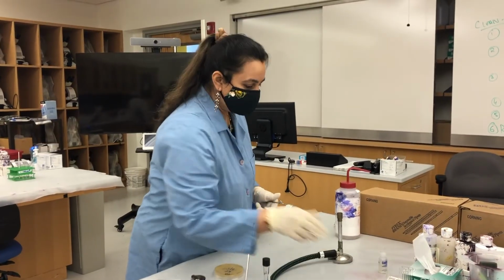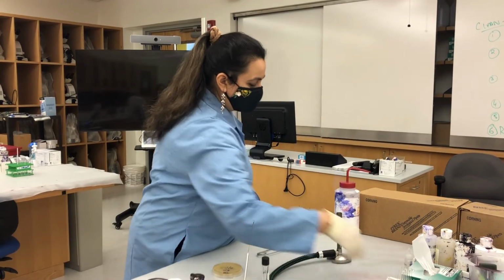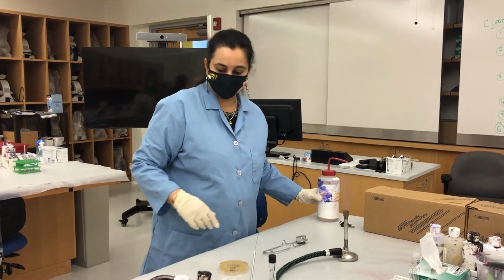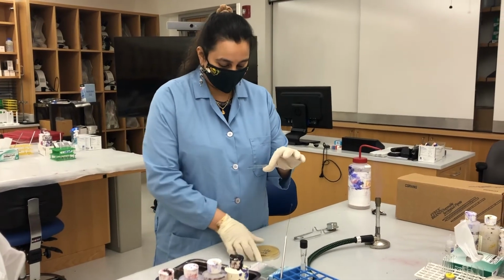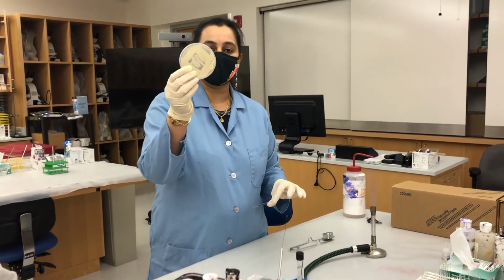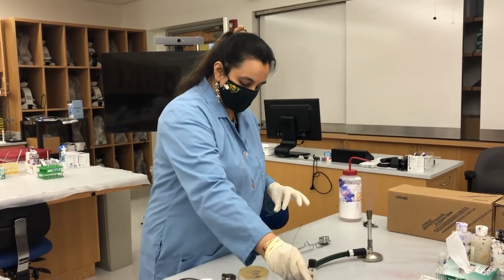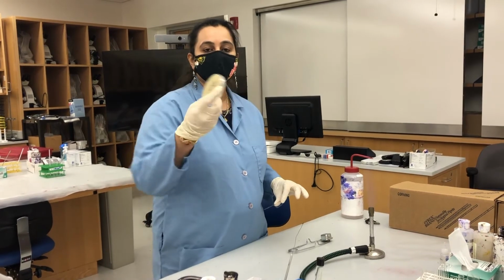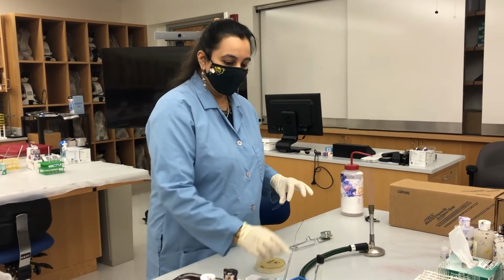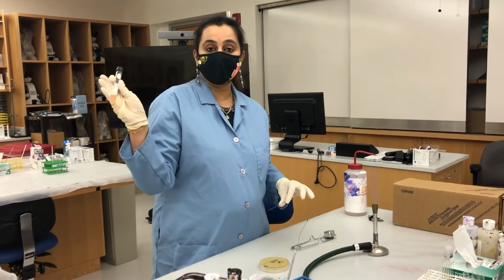Let's just light the Bunsen burner. We have the flame going and we are ready to make the bacterial smear. So today I'm going to show you how to make the bacterial smear using the solid culture as well as the liquid culture. I have gram positive bacteria, Staphylococcus aureus, on the plate here, and gram negative bacteria, Serratia marcescens, as a liquid form.